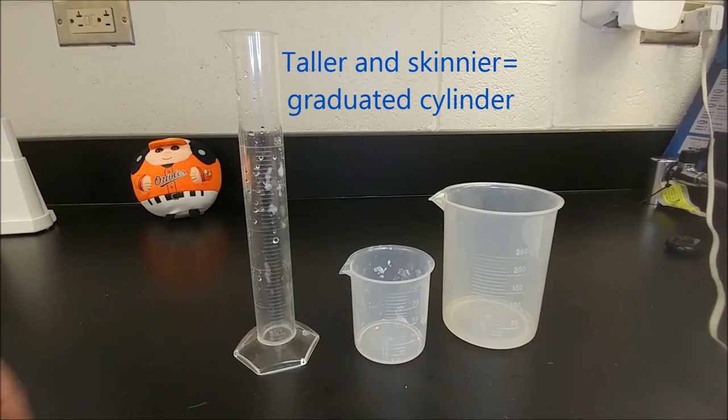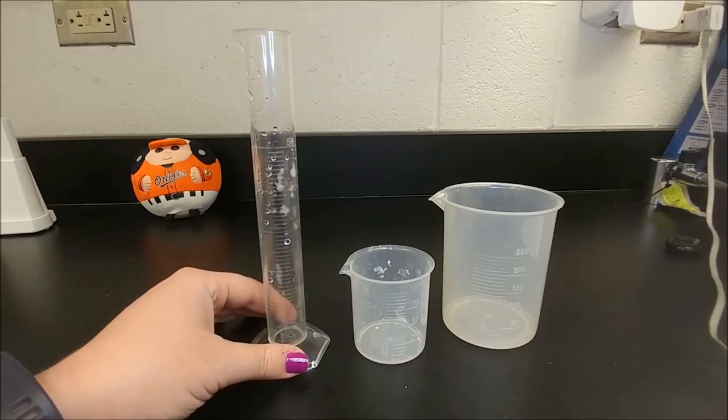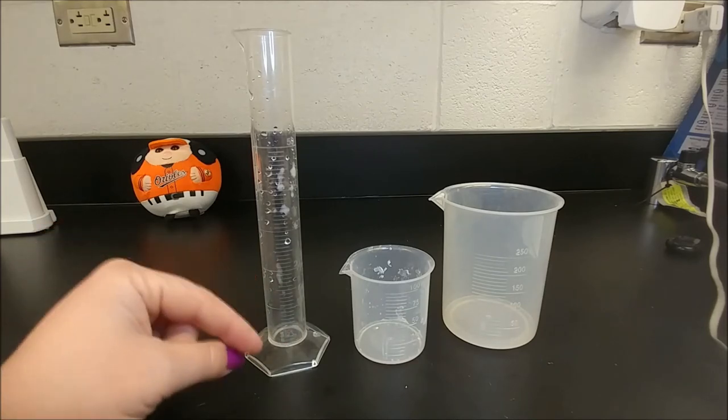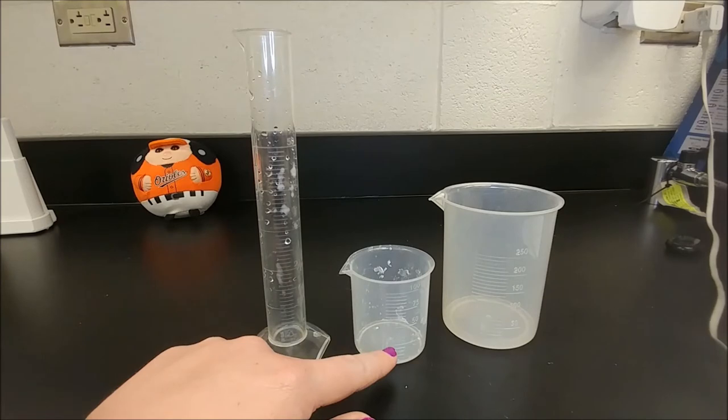Scientists prefer to measure fluid volume using a graduated cylinder because it is more accurate. There are more lines, they're closer together, so it's a more accurate measurement than using a beaker.